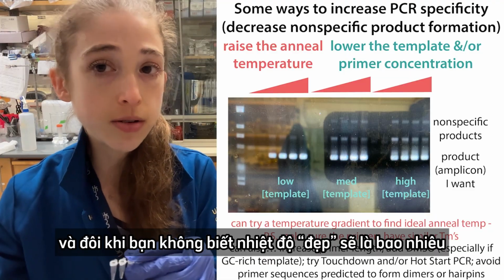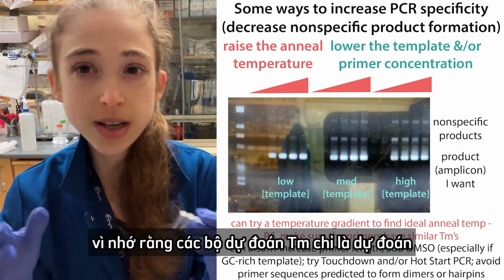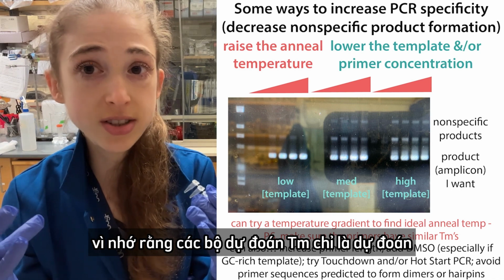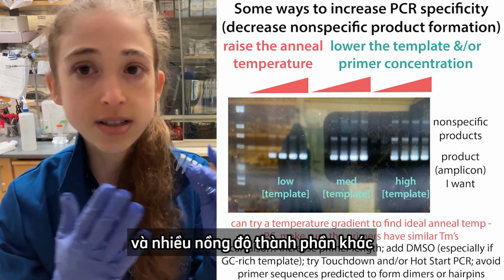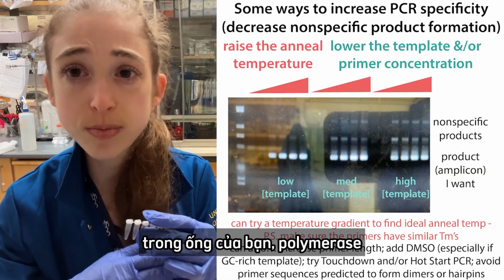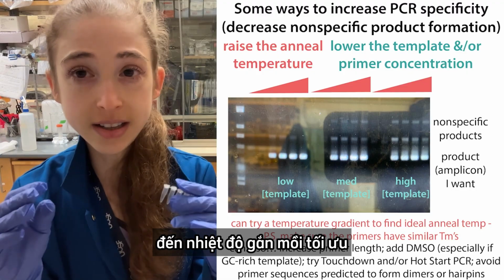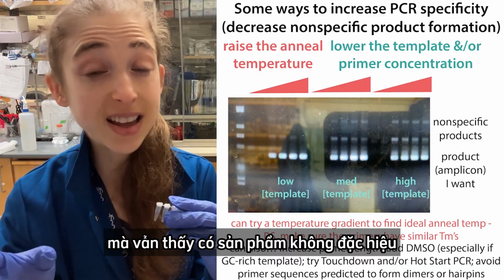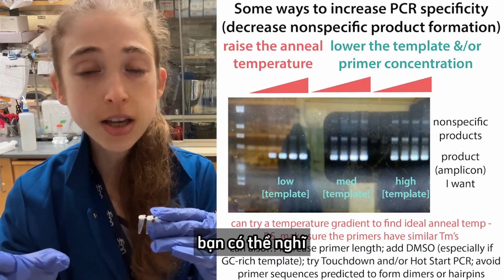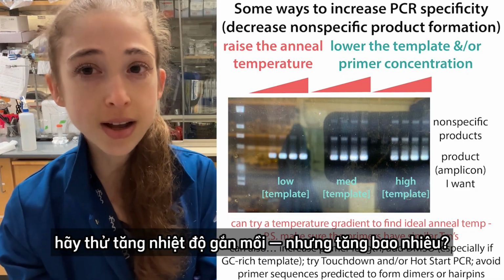Okay, so that was things that we're dealing with the temperature. And sometimes you don't know what the good temperature is going to be, because remember, those Tm predictors are just predictors. It's also going to depend on things like salt concentrations and various concentrations of things in your tube, the polymerase. All this stuff is going to impact what the ideal annealing temperature is. So if you run your reaction and you find that you get some non-specific products, you might say, okay, let's try raising that anneal temperature, but how much?